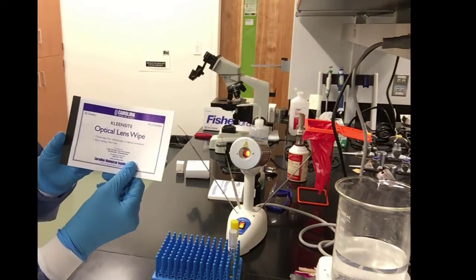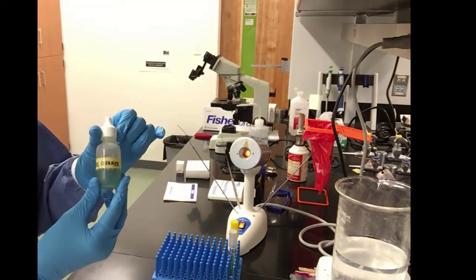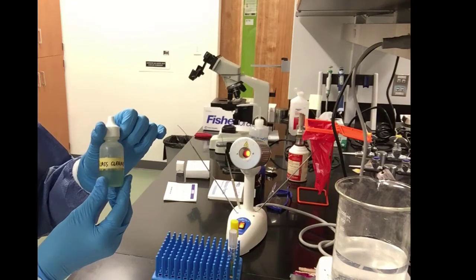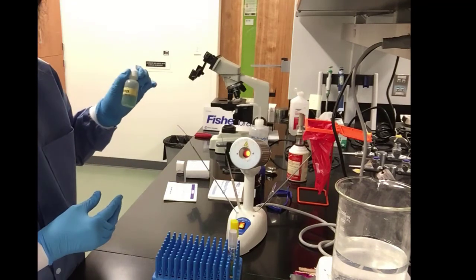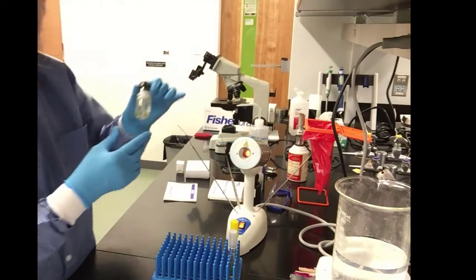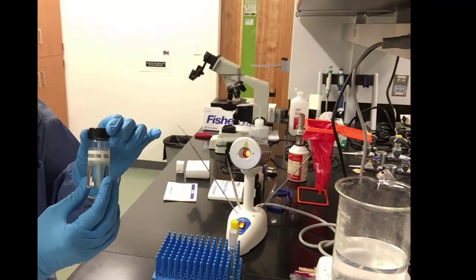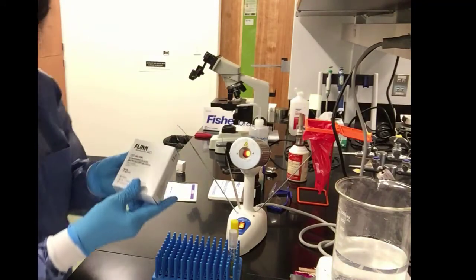We will need optical lens wipe paper. We will need the lens cleaner. The reason why we need those two items, the wipes and the cleaner, is because we will be using the 100x lens with immersion oil. So we will need to clean our immersion oil. Of course, we need slides.